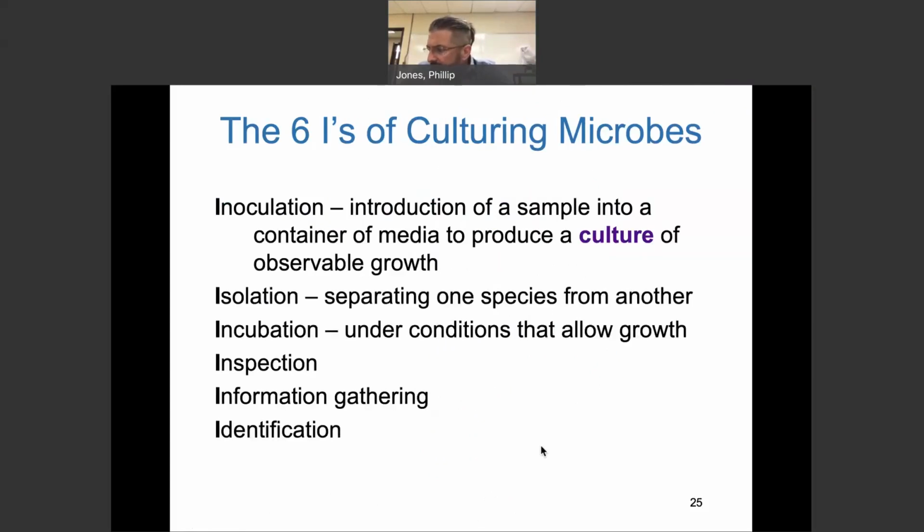I think I've got some E. coli that actually has some cultures, and you'll see. If you were in lab Tuesday, I pulled some of the plates out and asked you to describe the colonial morphology, and you were able to tell, well, that's raised, that's circular, that was glistening, that was more matte, and we played around with that for a couple of minutes.